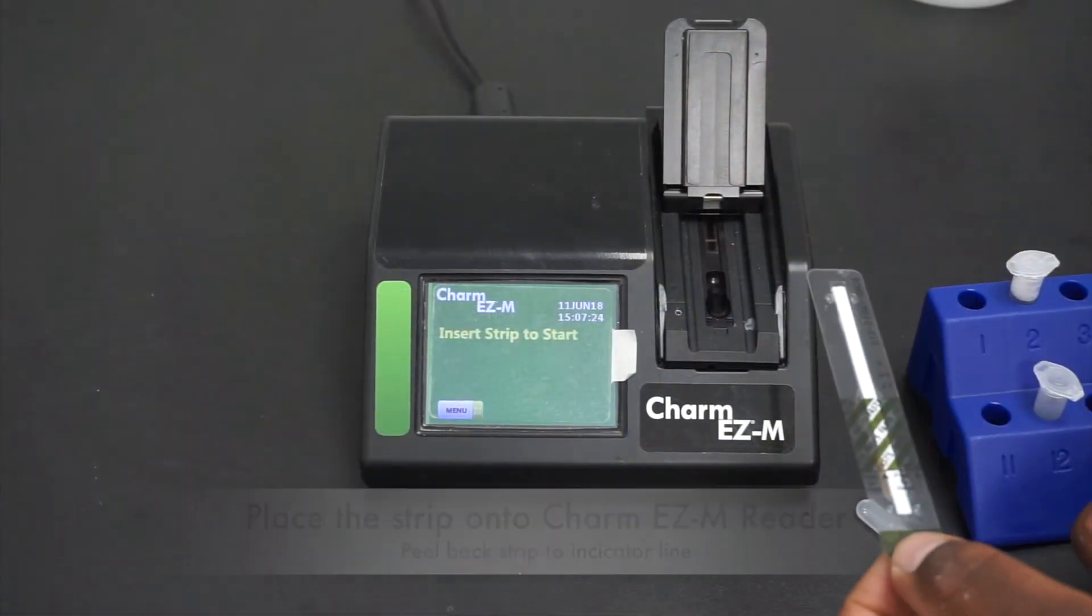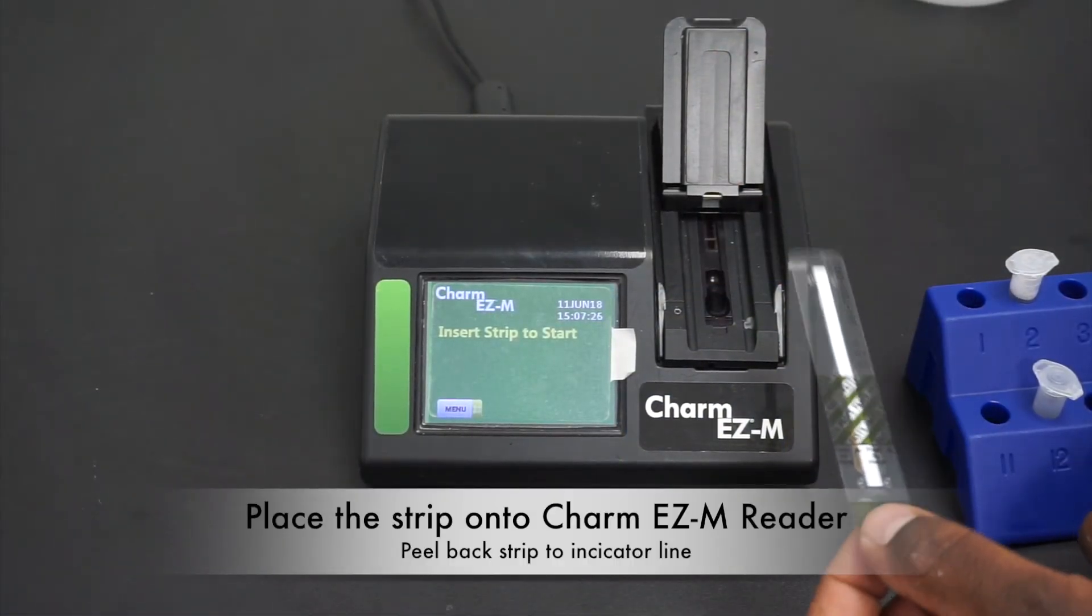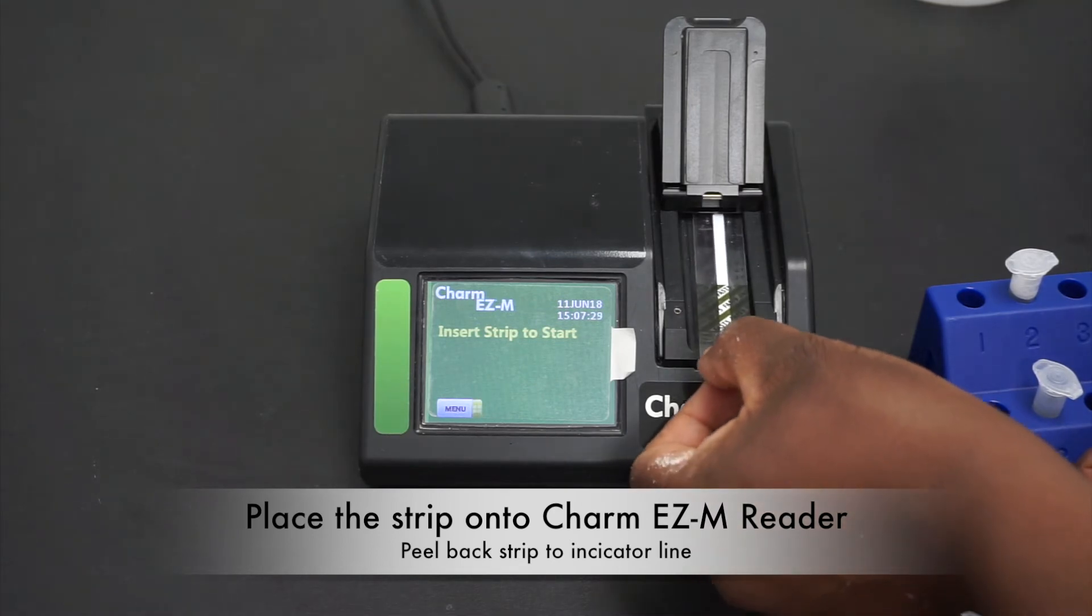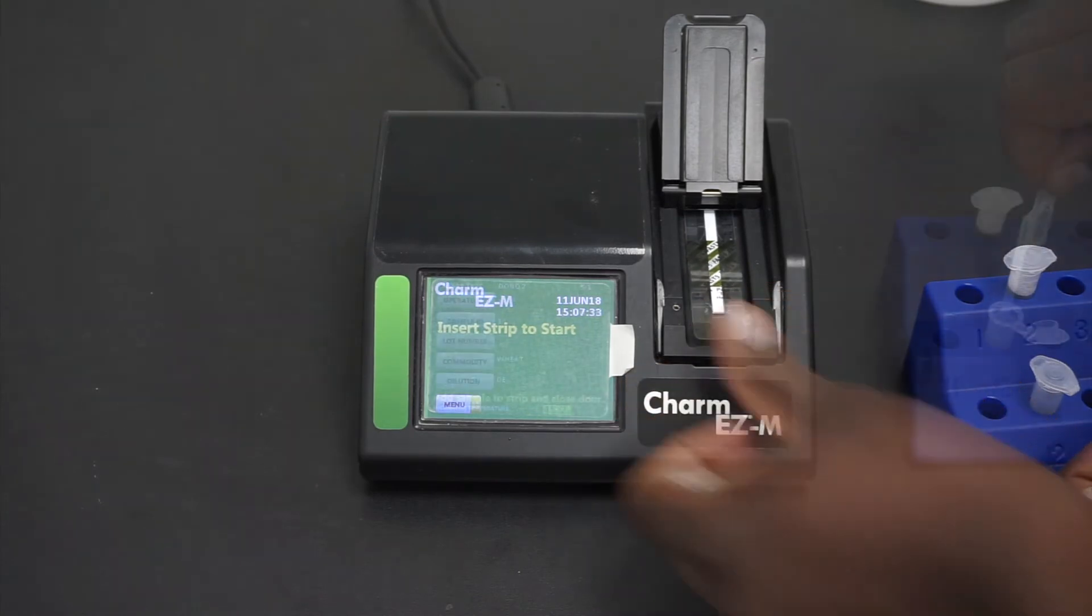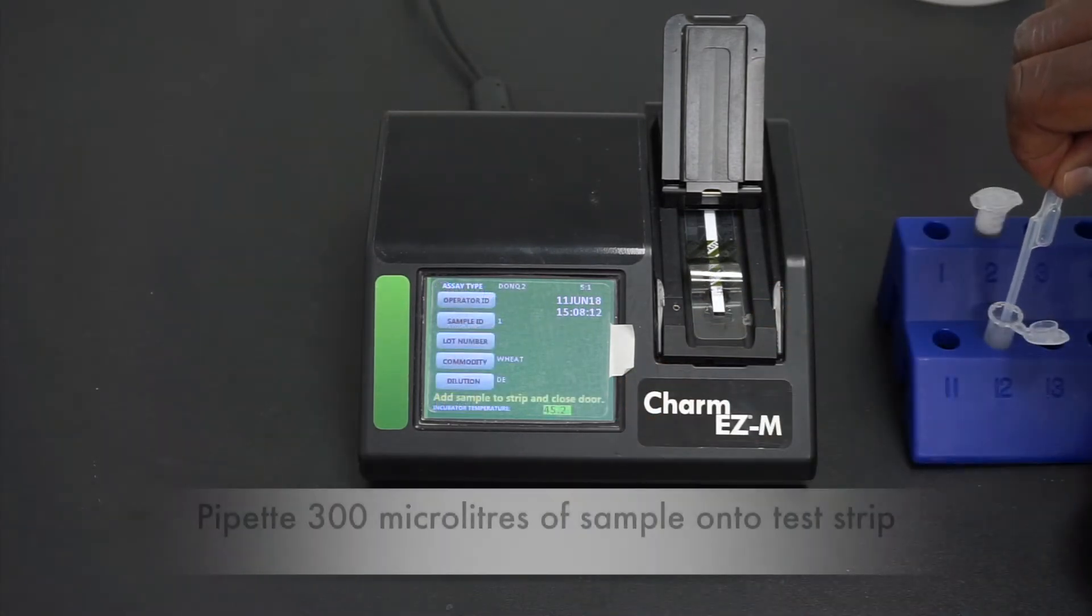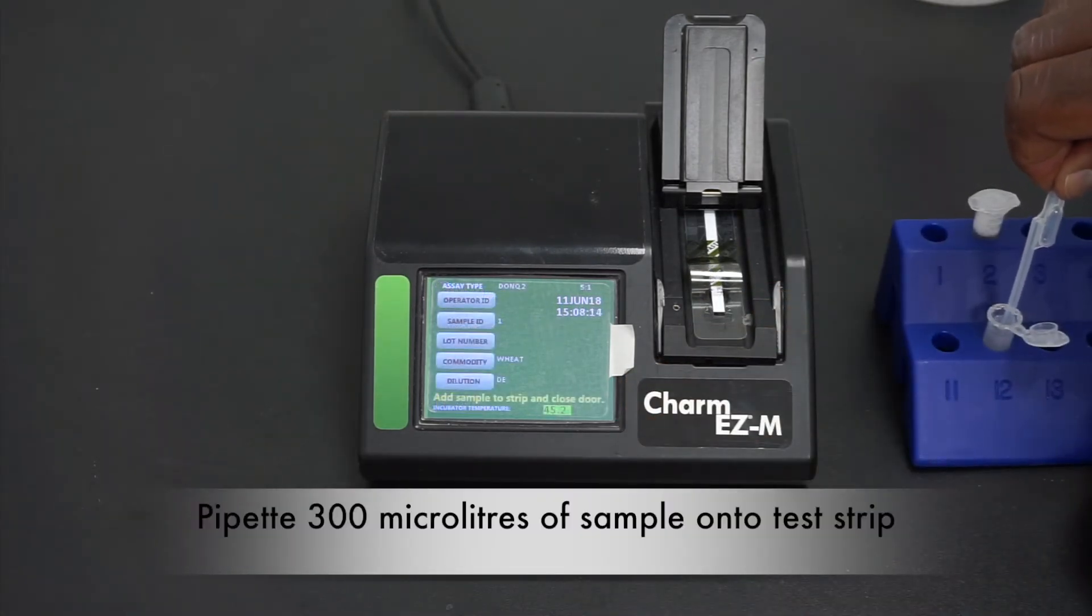Insert your DonQ-2 strip into your Charm EZM reader. Pipette 300 microliters of your diluted sample onto the test strip.